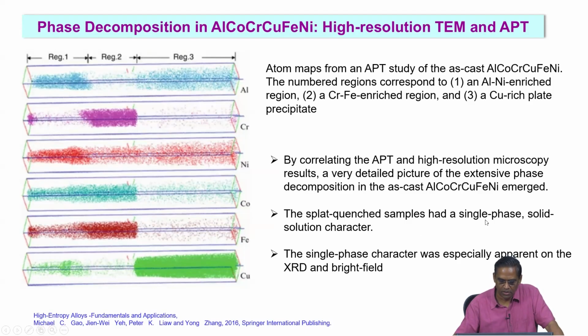The splat quenched sample had a single phase solid solution character. Of course, the single phase character was also supported by the XRD and the bright field TEM images.